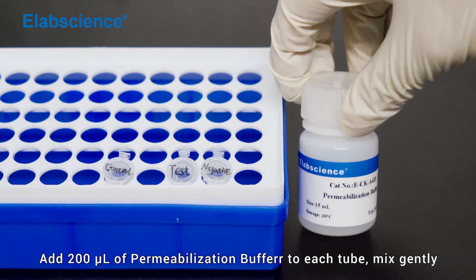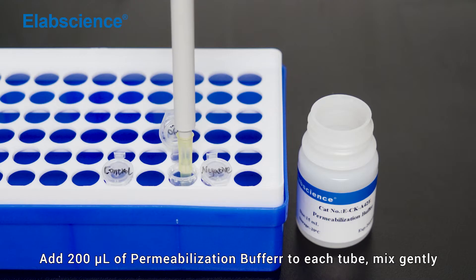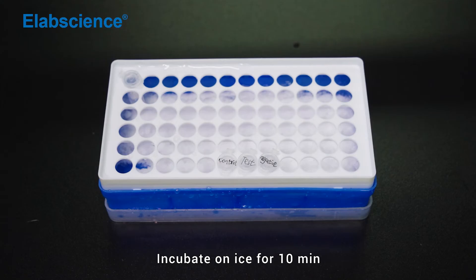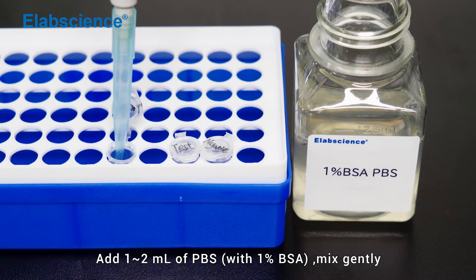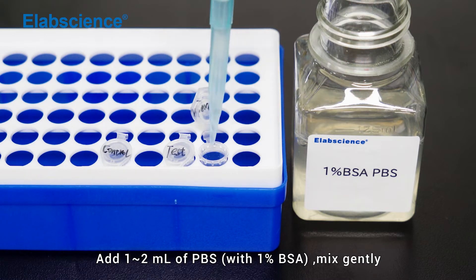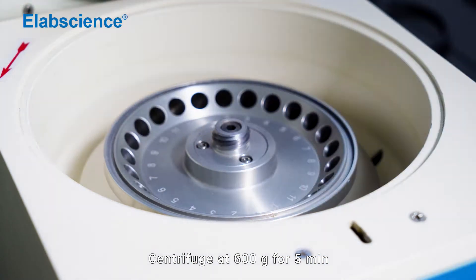Add 200 µL of permeabilization buffer to each tube and mix gently. Incubate on ice for 10 minutes. Add 1–2 mL of PBS and mix gently. Centrifuge at 600×g for 5 minutes. Discard the supernatant.